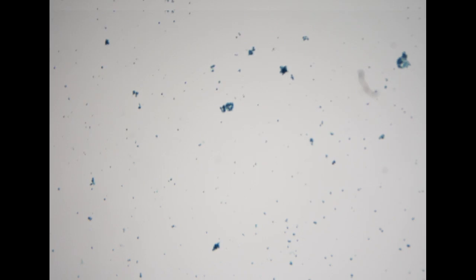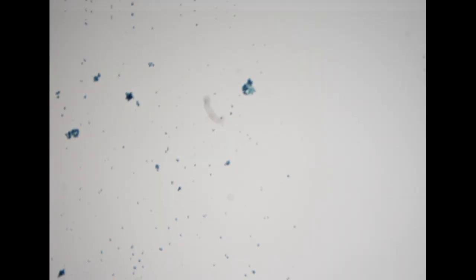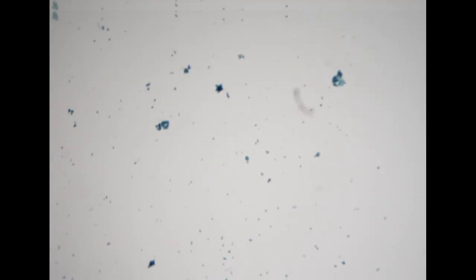Yeah. So next, it's also a urine cytology specimen, a 55-year-old female. This is not a voided urine, this is an instrumented urine. This is a ureteroscopic washing cytology from the renal pelvis, so it is from the upper urinary tract. For an upper urinary tract specimen, because usually it's a washing specimen, we expect to see larger cohesive fragments of urothelial cells, unlike in the voided urine specimen, where usually we only see individual single cells.